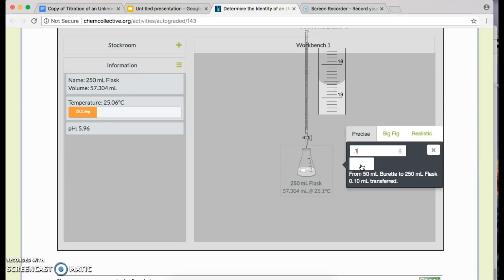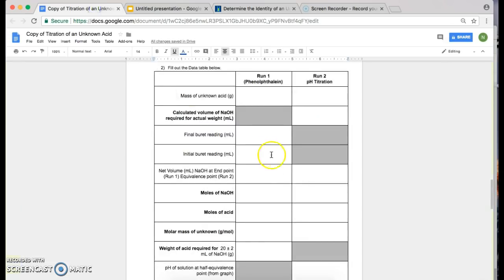Okay, it still hasn't turned super pink. So now this one is 18.59. Okay, and then it gets this kind of pink, which actually isn't terrible. So somewhere between 18.59 and 18.69. So I'm going to go with 18.69 as where I'm going to stop. All right. So I'm going to go ahead and record that down here.